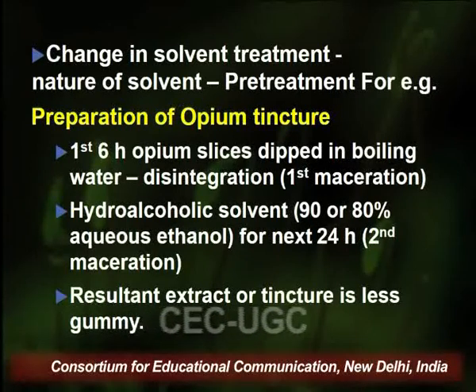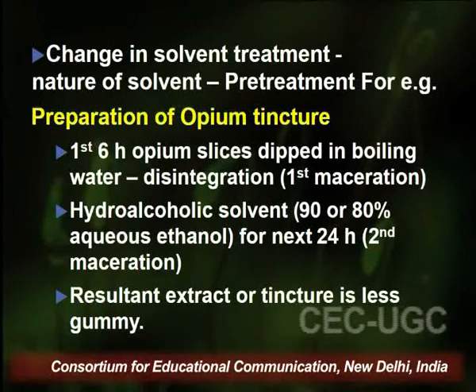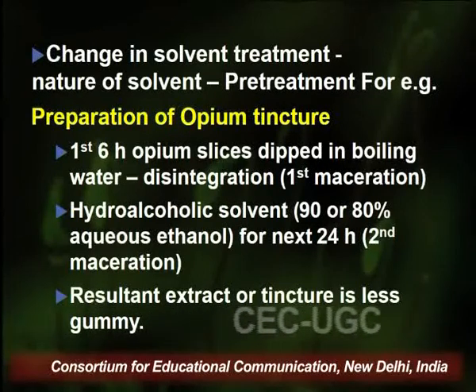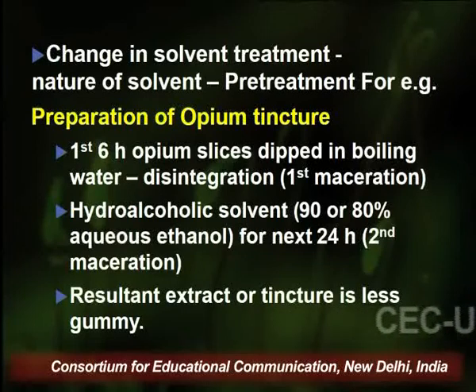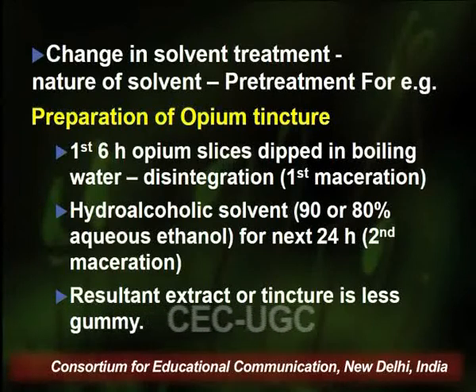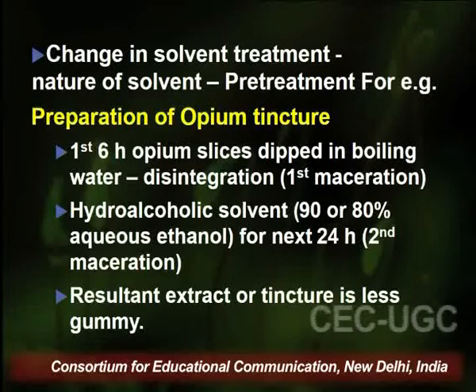Now since the water treatment has caused swelling of the drug and the formation of capillaries between the drug particles, this aqueous ethanol will easily enter into those drug particles and extract out the desired material, and the resultant extract or tincture is less gummy in nature. So this is how you can always modify the extraction procedure depending upon the type of drug you are dealing with.